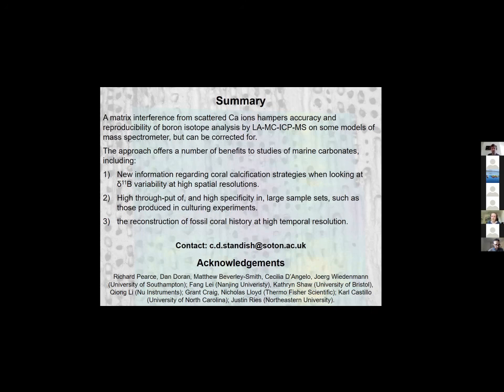Yeah, so working with Talia Babila, we've been working on some benthic foram data sets, and she's currently writing up a study on those. And so these are sort of around the mid-range, I guess, because they're benthics, well, maybe 150 to 200 micromoles per mole. Apologies if I just got that wrong, Talia.